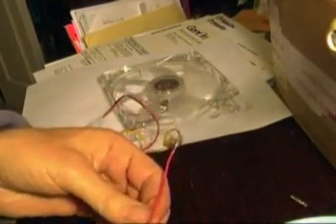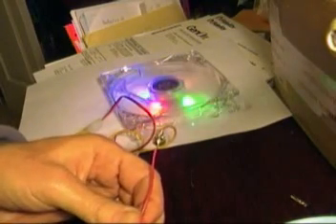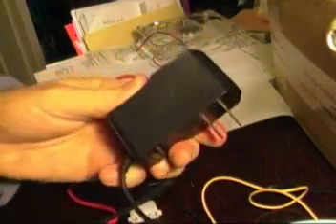We get some sparks of life here, and we proved to ourselves that the power supply is going to drive the fan. It's a 1,000 milliamp power supply — it should be plenty.